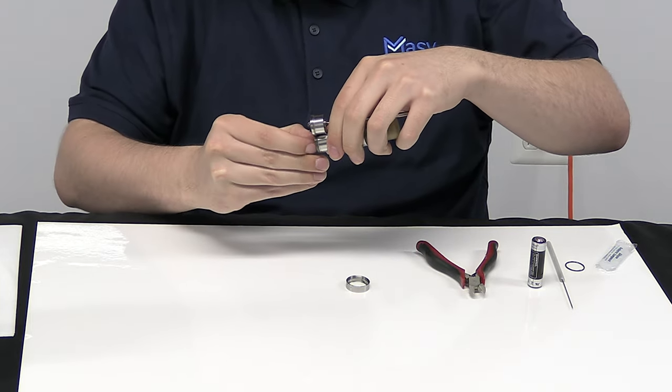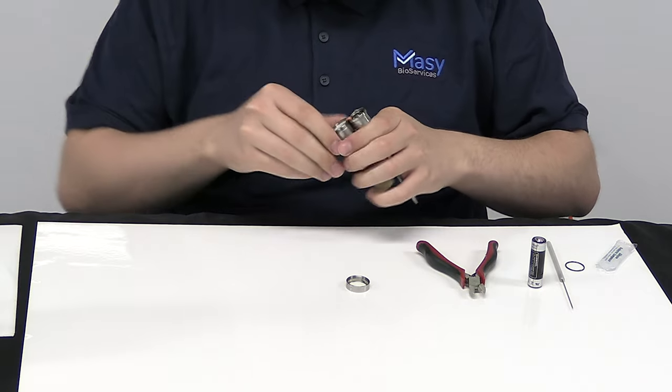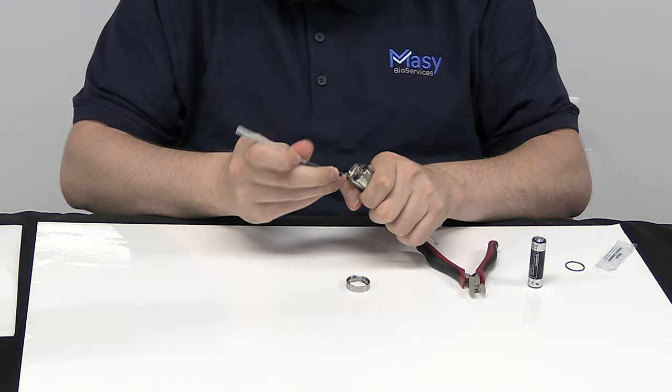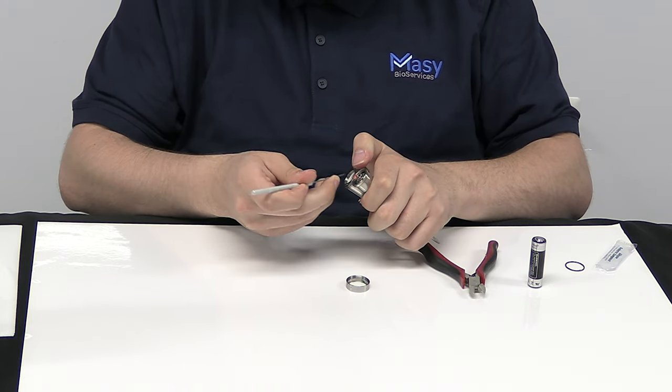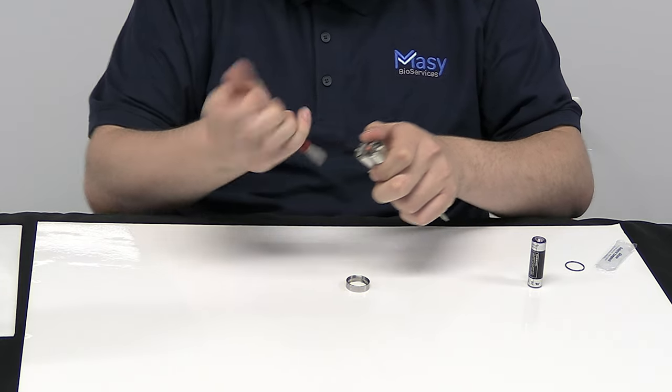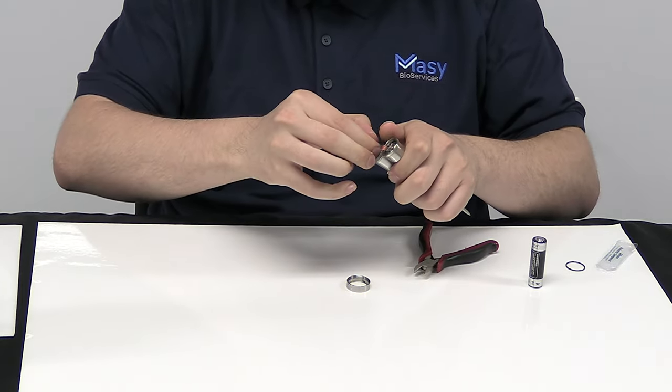Then we just slide out the old battery and put it aside and use our metal pick to pull out the old ring. At this point we'll want to use our clippers to snip that and discard it.